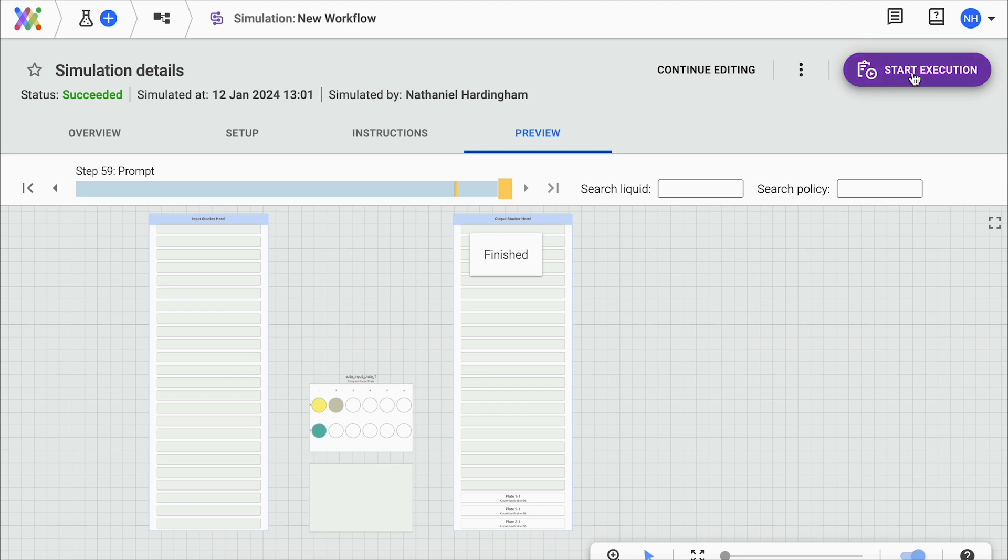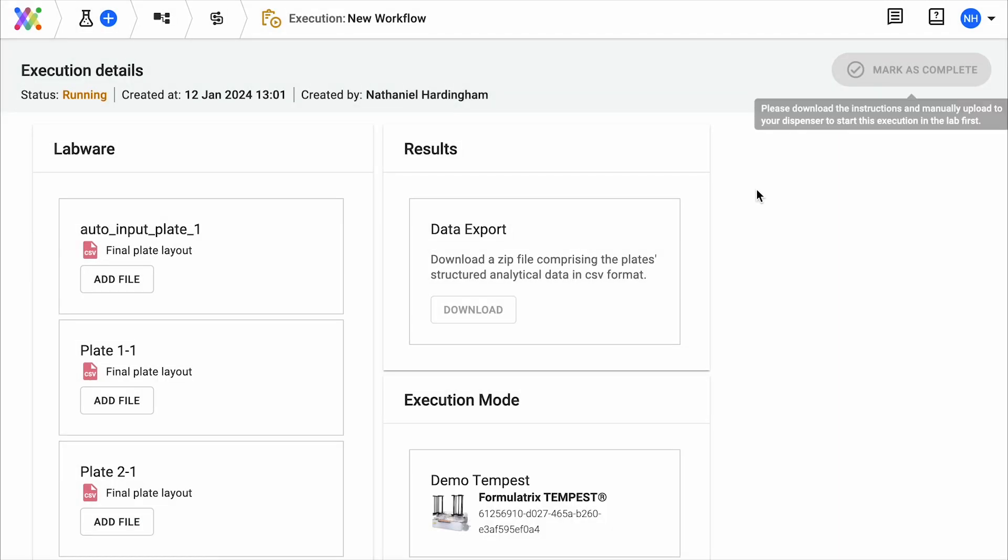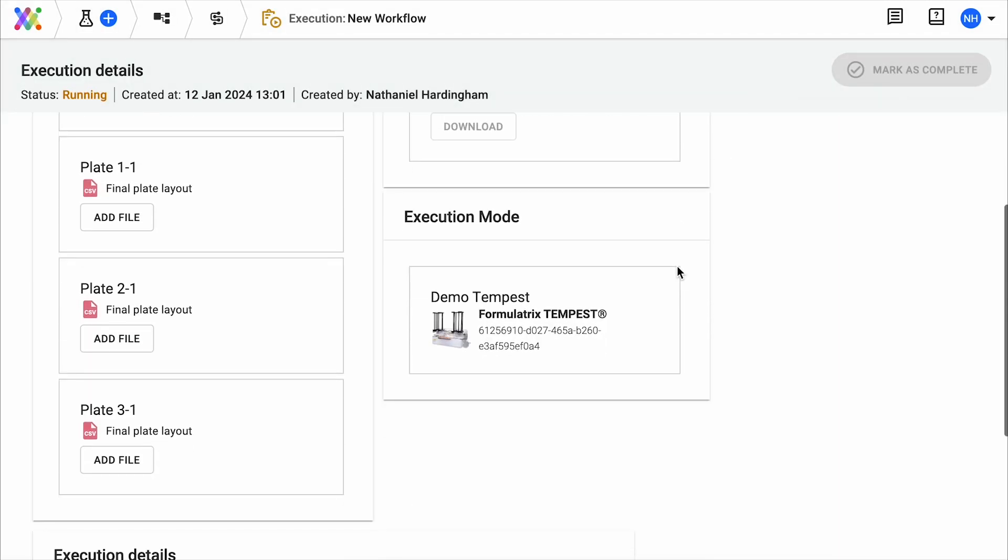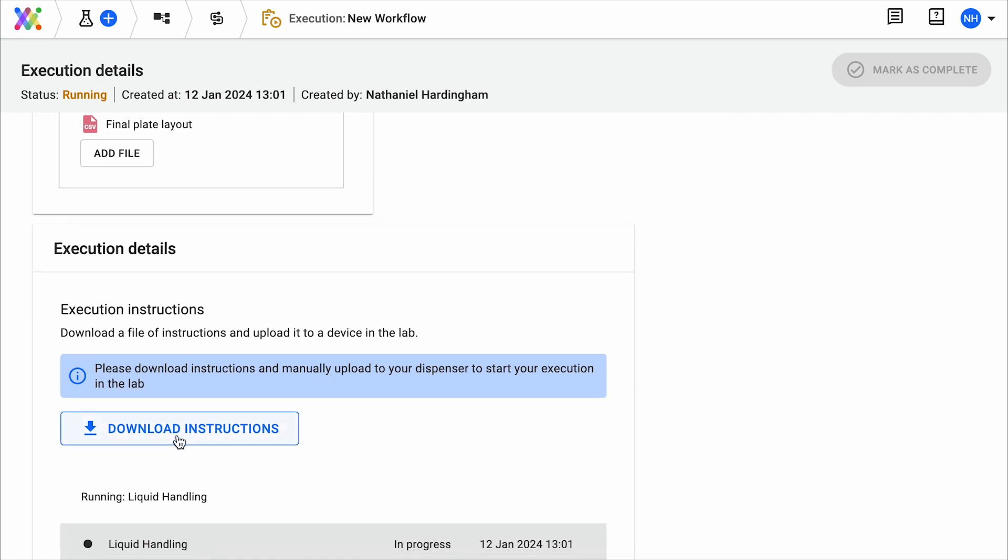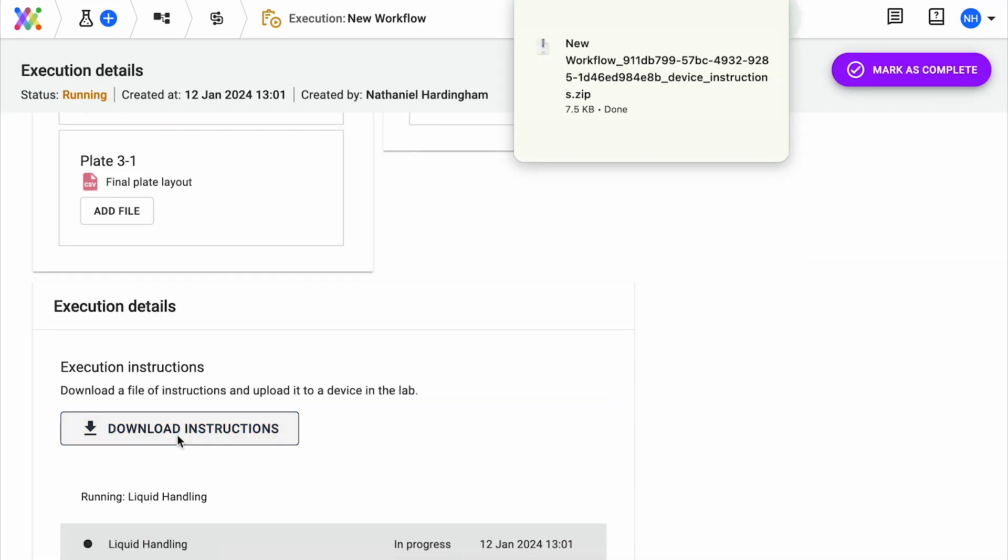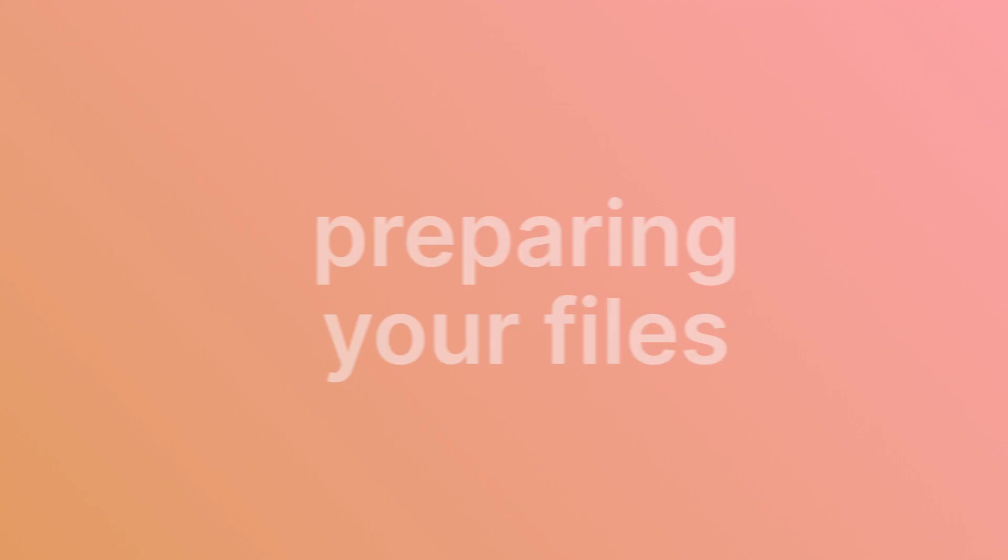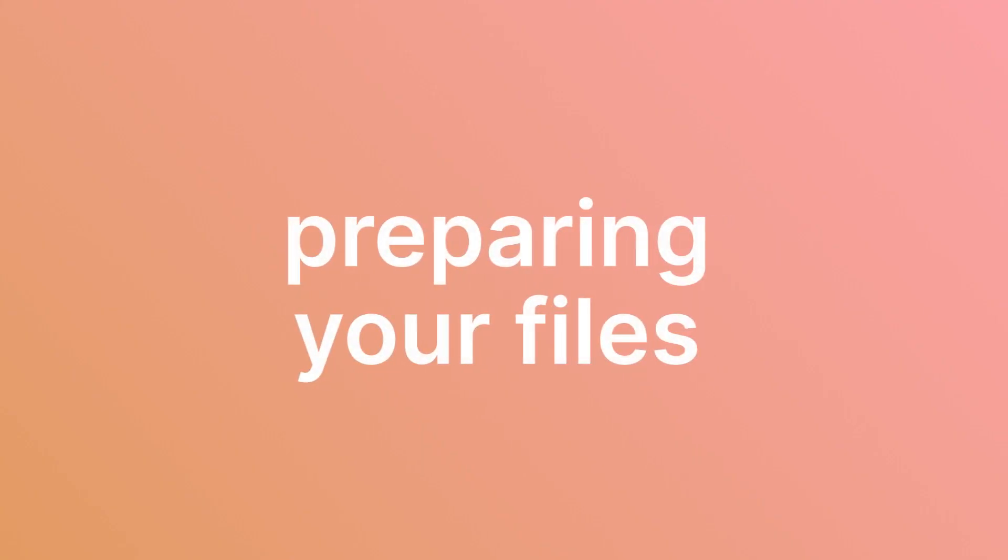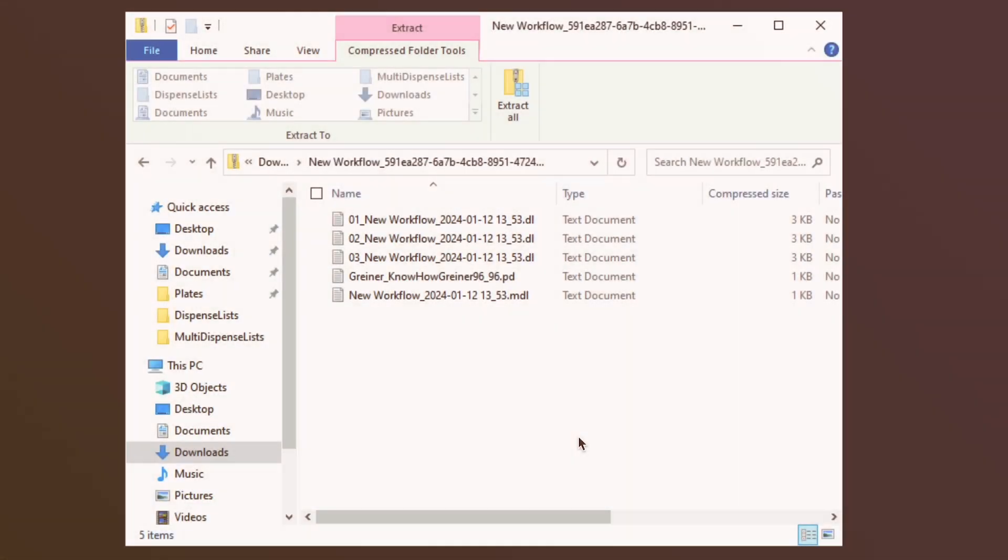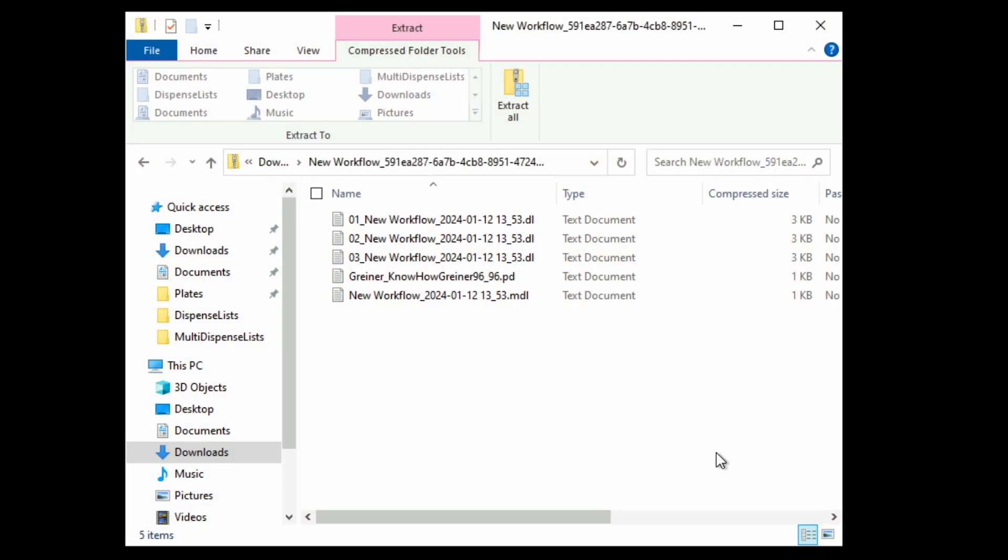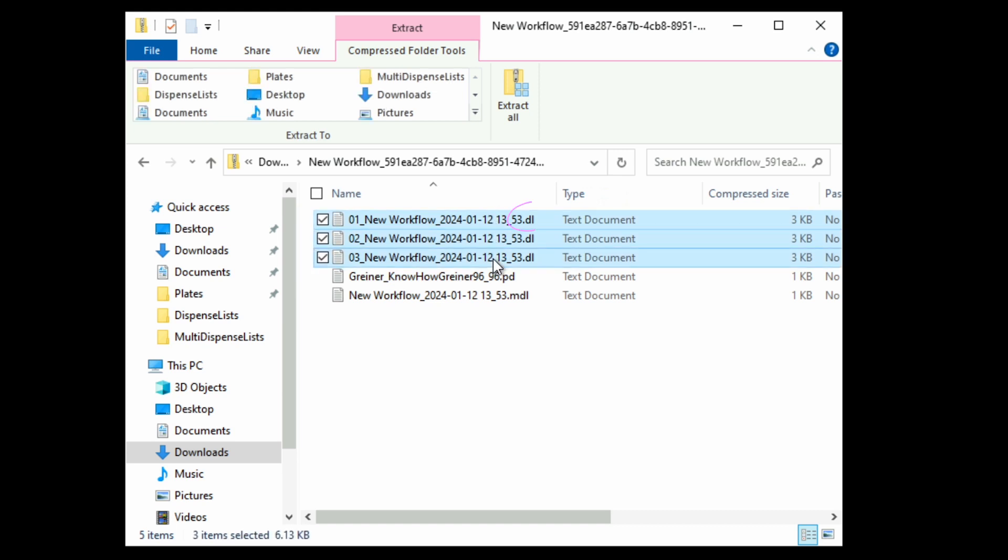From here, you can download instructions for your Tempest. You'll download a zip file containing three types of text files. The dispense lists, ending in .dl, provide the volumes and locations of where each liquid will be dispensed.